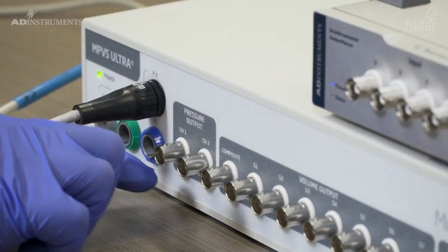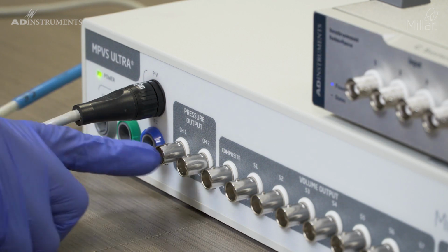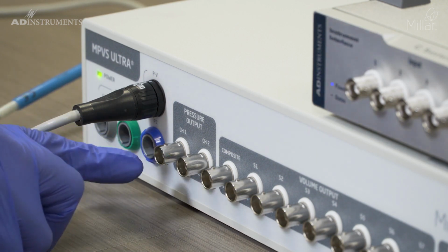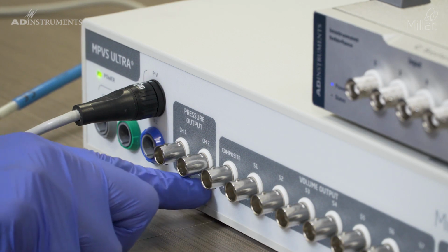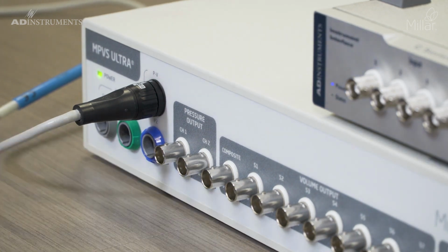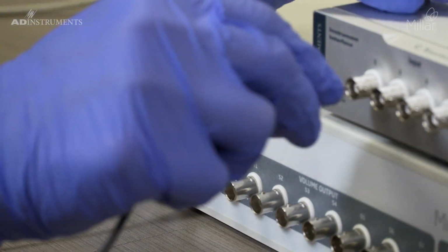Next to the input connectors, we have several BNC output connectors. The first group of 2 is for pressures. P1 is the pressure from the PV catheter, and P2 is from the PV catheter if it has 2 pressure sensors, or if a second standalone pressure is required. Here we will connect P1 to the first input on the C-Series instrument interface.